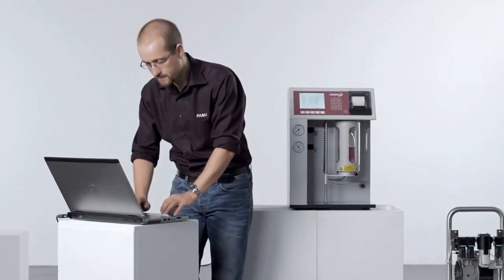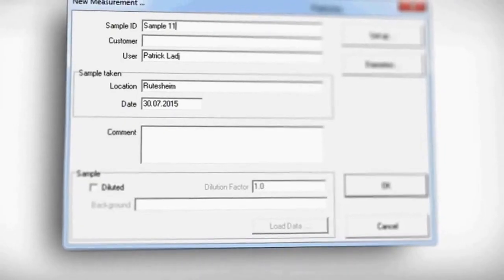All measuring parameters can be easily set up with the aid of the PAMAS PMA software.